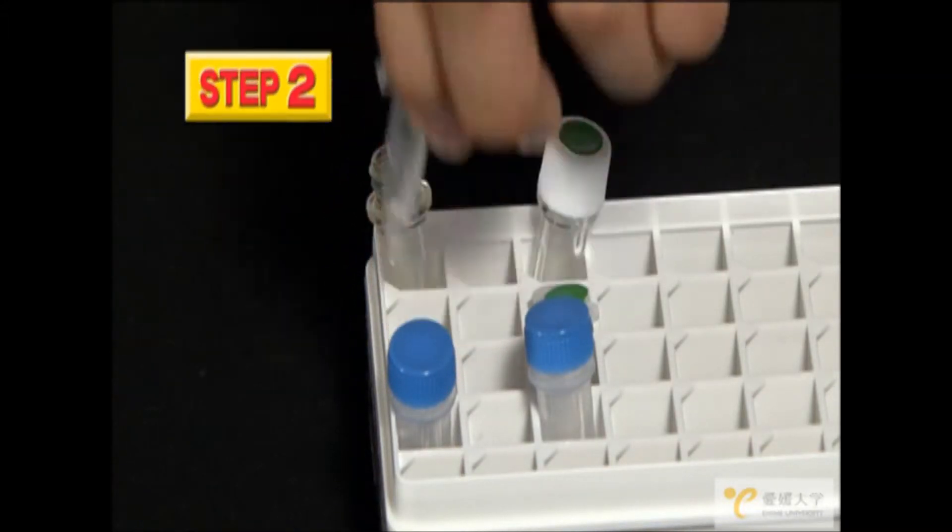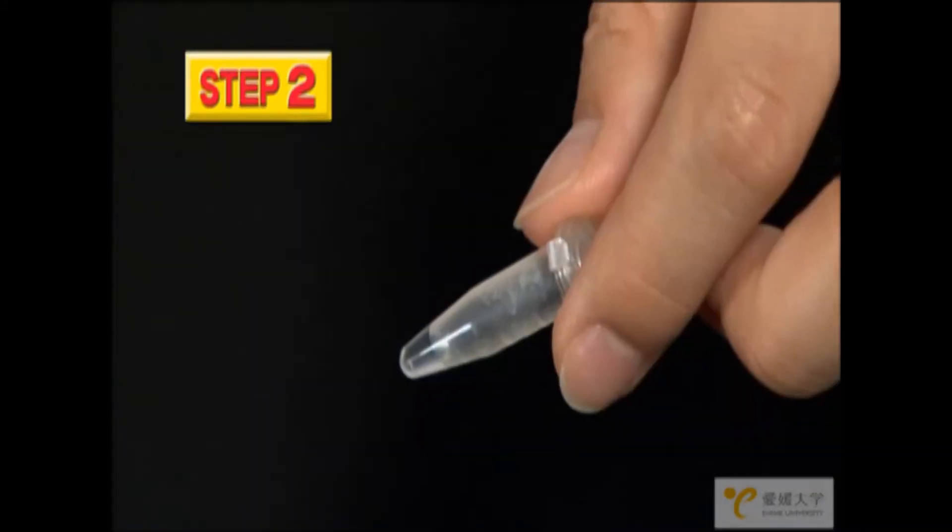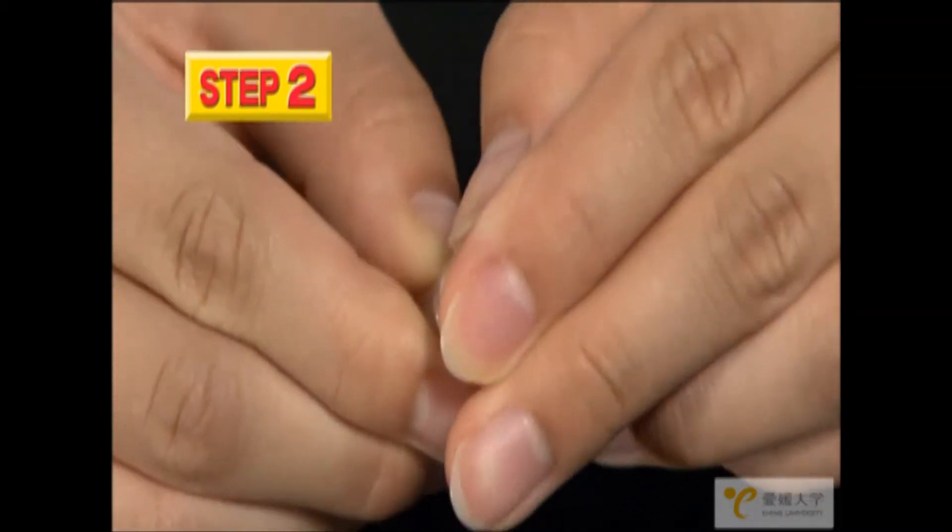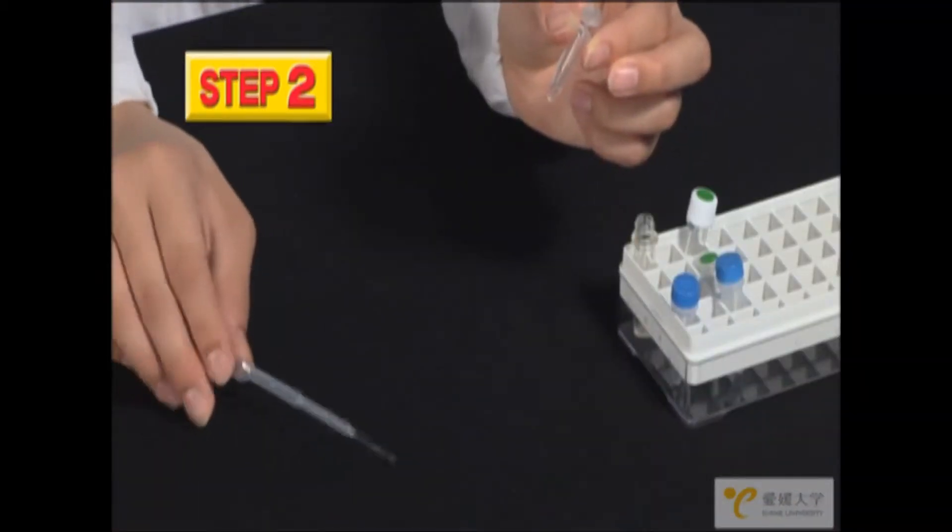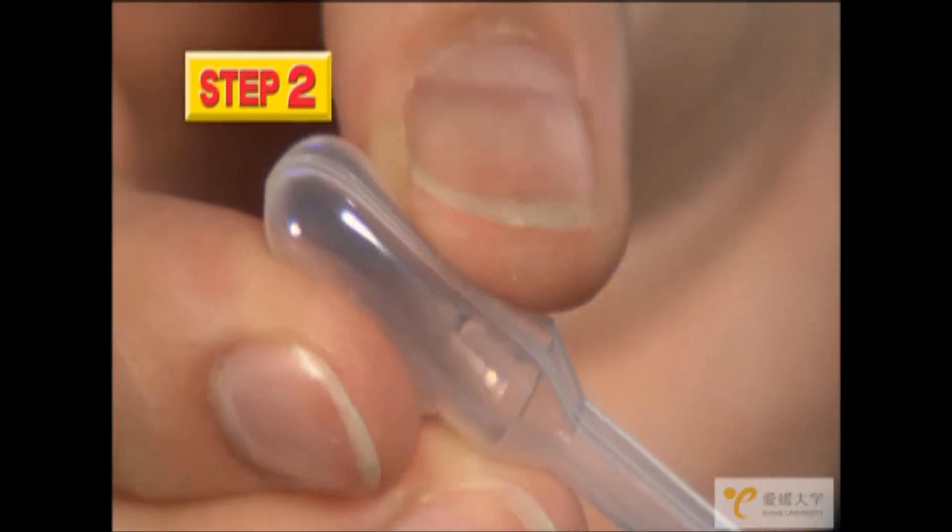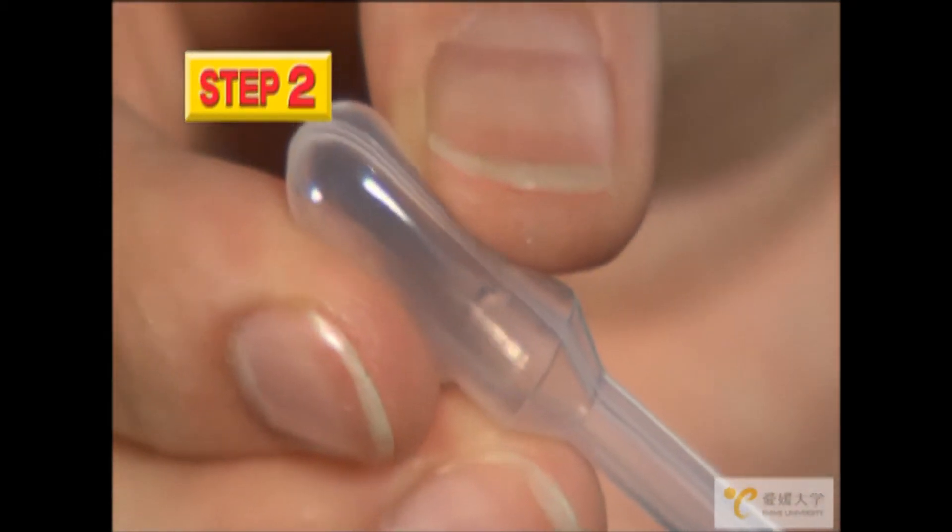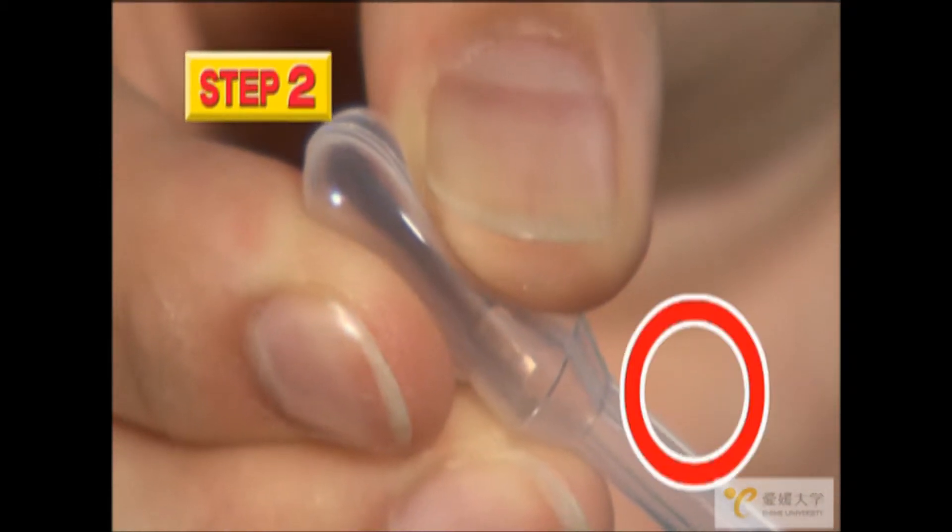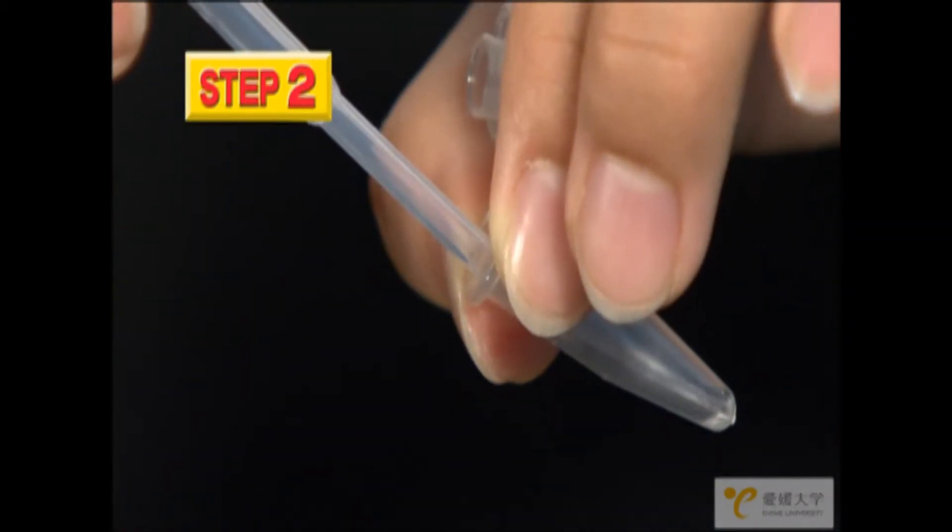Next, take the small tube without the green dot. Make sure the liquid is at the bottom and then take off the cap. Use the dropper to collect the liquid. Do not squeeze the dropper hard. Just gently squeeze it to obtain the liquid. And expel the liquid into the large tube.